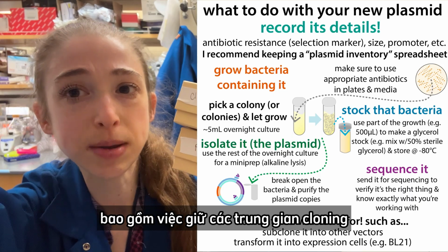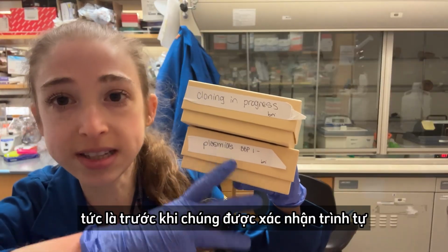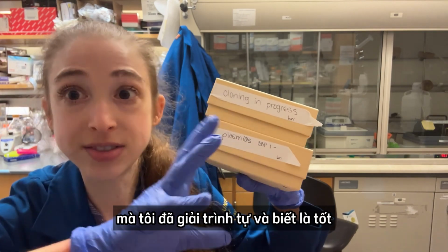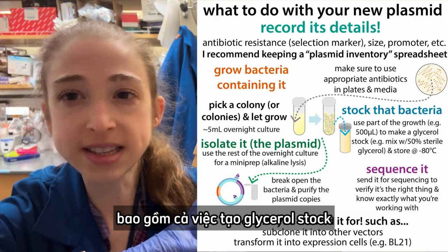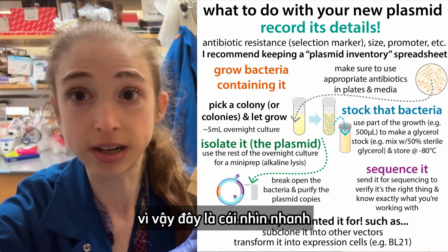It includes keeping my cloning intermediates, before they're verified sequences, physically separated from my actual plasmids that I have sequenced and know are good. This includes things like making glycerol stocks and all of this sort of thing. So here's just a quick look.